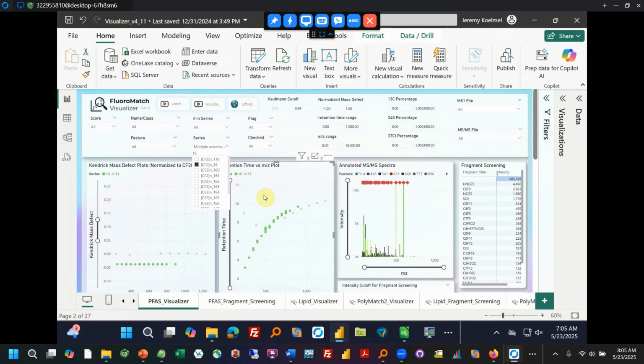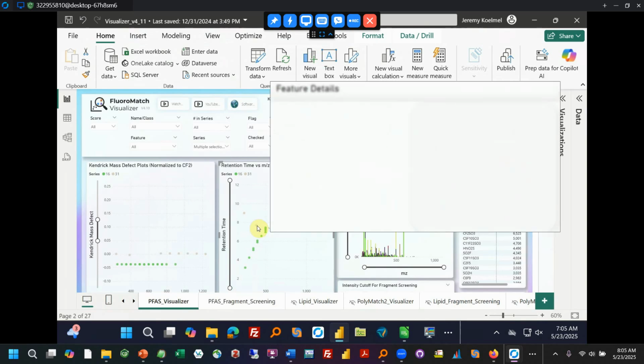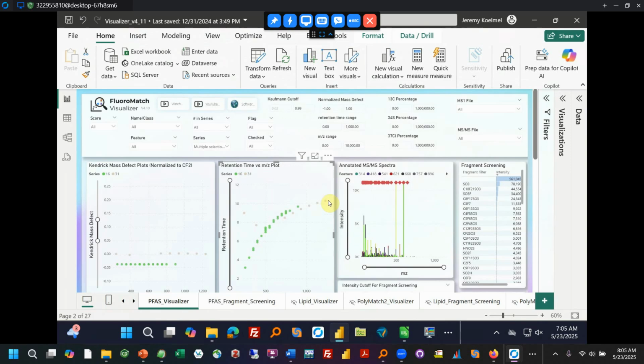And now we can see what those series look like. And indeed, it doesn't look like this would fall within that series over here. You can see how this helps extend your logic of how the chromatographic gradient is and how the series should look. So in the end, I would throw out, you can shift click even if you want, highlight these.